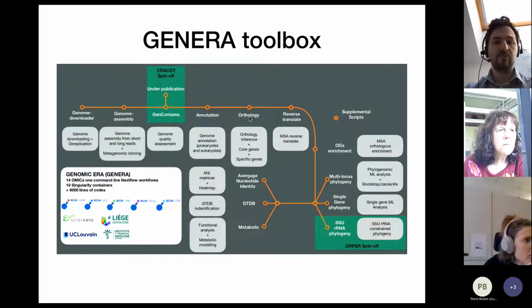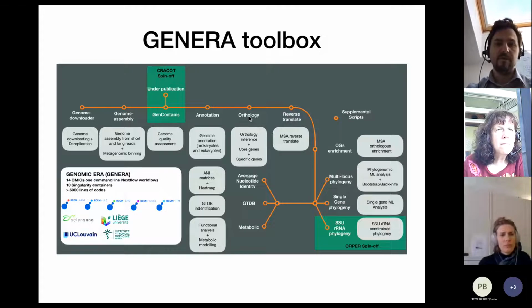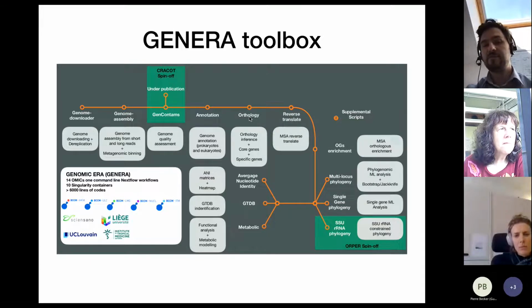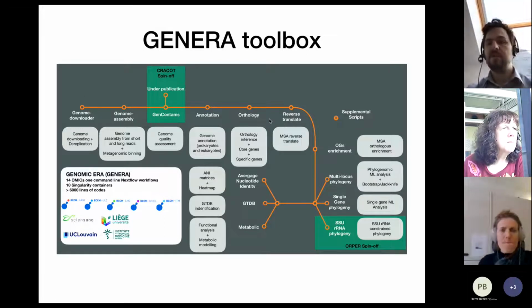Each topic corresponds to one workflow that you are able to run with one command line. To run that, you will connect to an HPC cluster and write some commands. Here is just one command to run it, but I would like to explain how to do that. And after that, we will go through each tool, explaining what they do and what you can achieve with them.